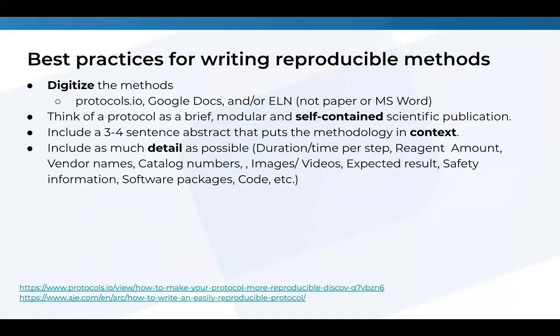So that means, as we saw earlier, try to put exactly the duration and time. So don't just say, then after I incubated something. Tell exactly how long you incubated, at what temperature, and all these things. It's really important. And yeah, there are a lot of people who just like to leave these details out.